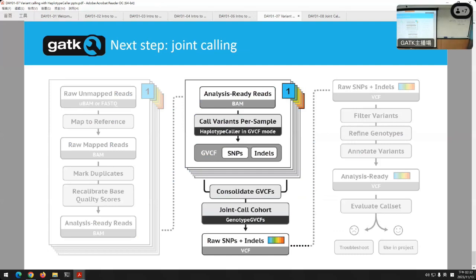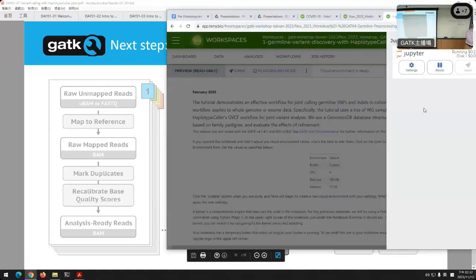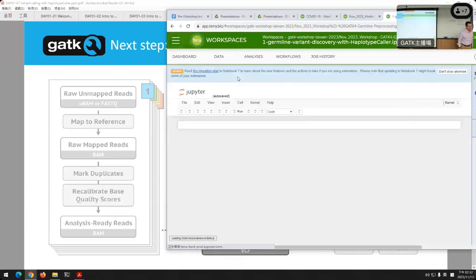Hi, Eric. Hi, team. I have one question about the HaplotypeCaller. You put a lot of resources into assembling the haplotypes, and the output VCF file, does it have the information of the haplotypes? Because we need the haplotype at the regional scale, not the global scale. It is enough, but does it have the information?